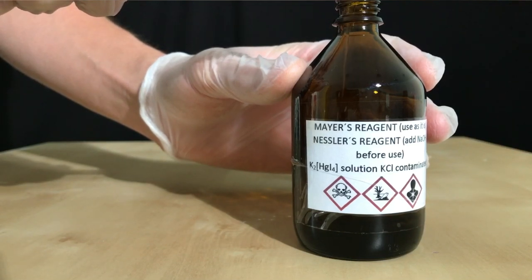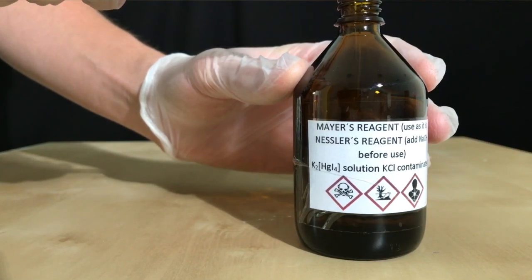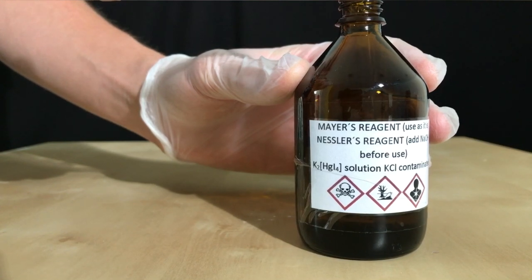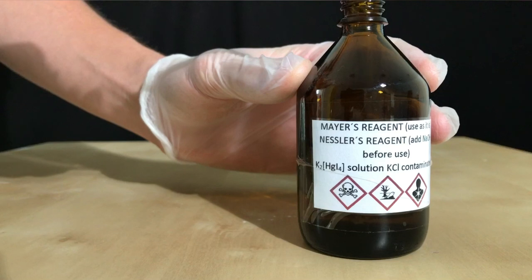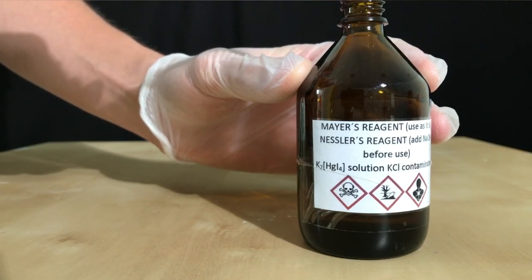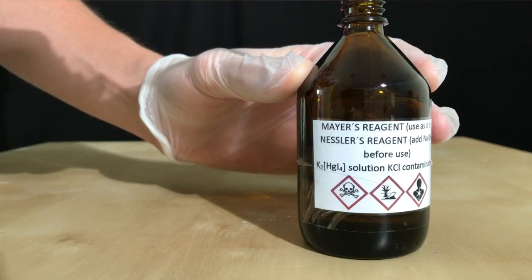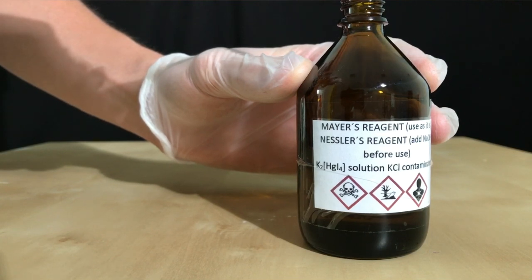If you want to use it as Mayer's reagent which is used to test for alkaloids, the solution should be used as is or in a slightly acidic environment. If you want to use it as Nessler's reagent which is used to test for ammonium ions, some sodium hydroxide may be added to whatever you want to test beforehand because Nessler's reagent needs an alkaline environment.